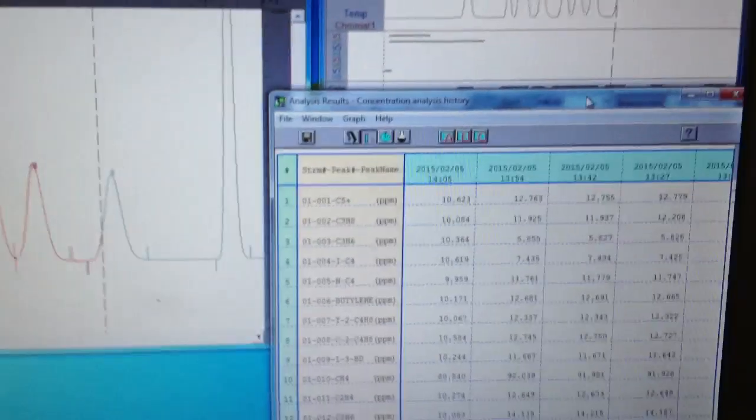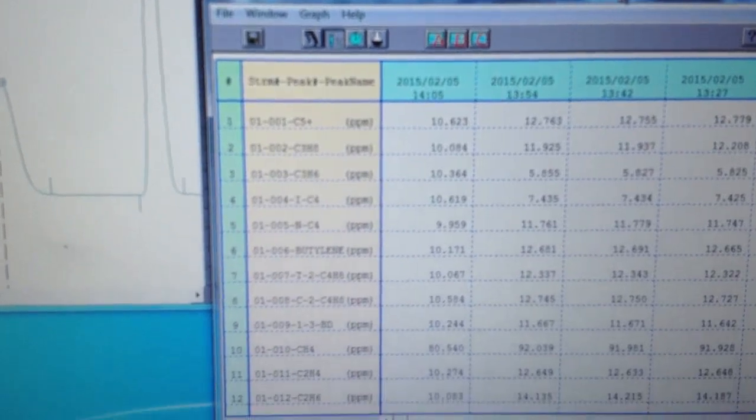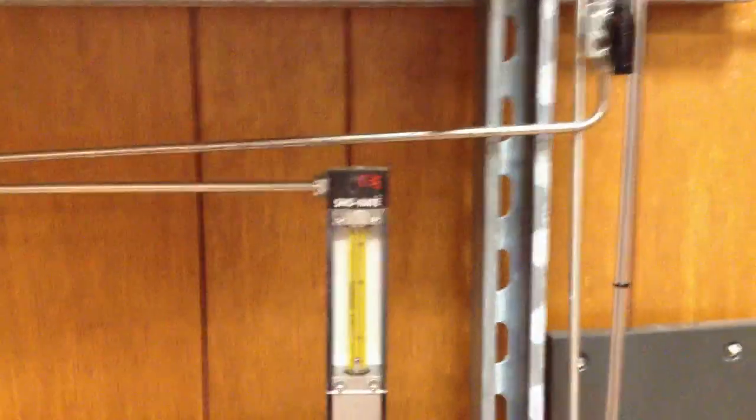Alright, so we calibrated the analyzer. All of those numbers look really, really good. We are running another chromatogram with cal gas, and then we are going to run the bag sample through it. The bag sample, I'm going to go ahead and bypass the RMAX and not even worry about using the RMAX, and I'm going to go directly straight in.